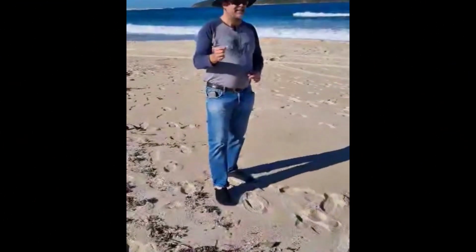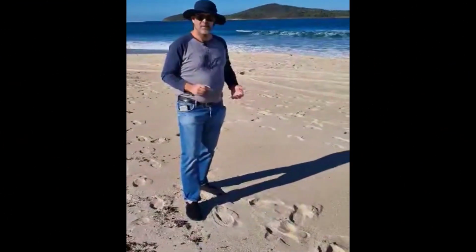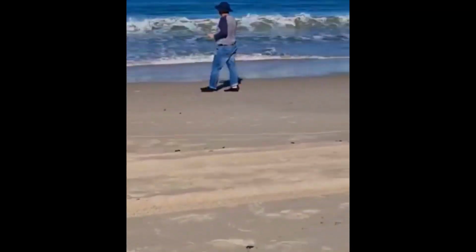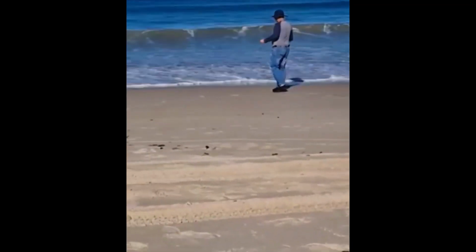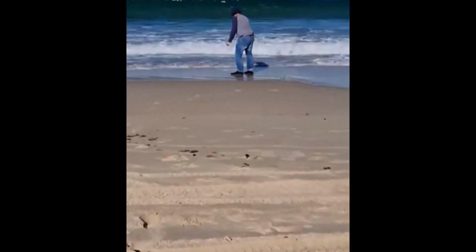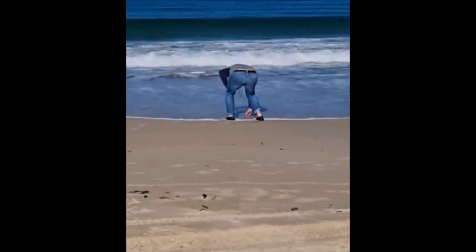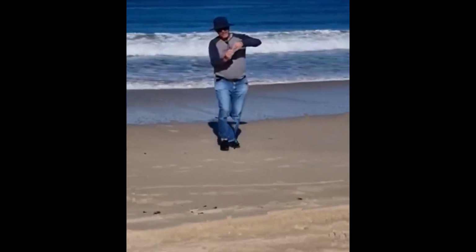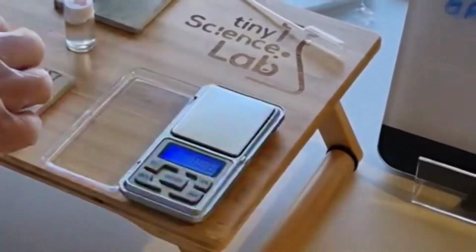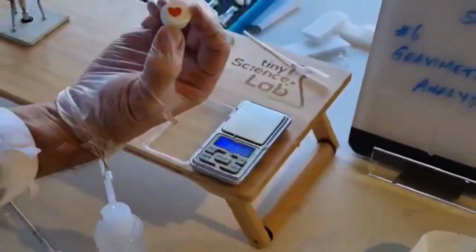So we're actually here to collect a sample of the water from Fingal Beach. Let's get ourselves a little sample. There's our sample from Fingal Beach. Let's now look at Fingal. Fingal is the red.